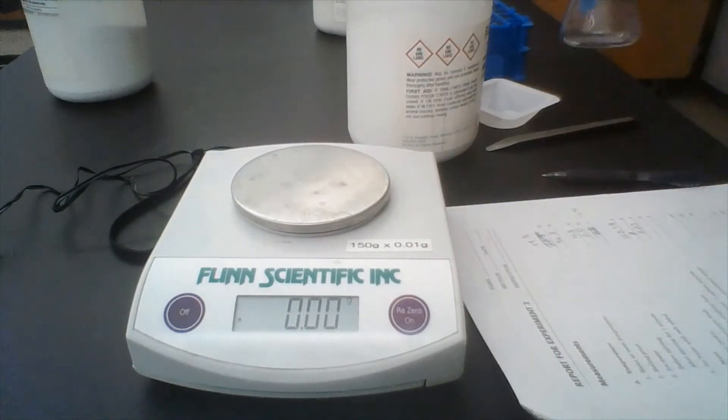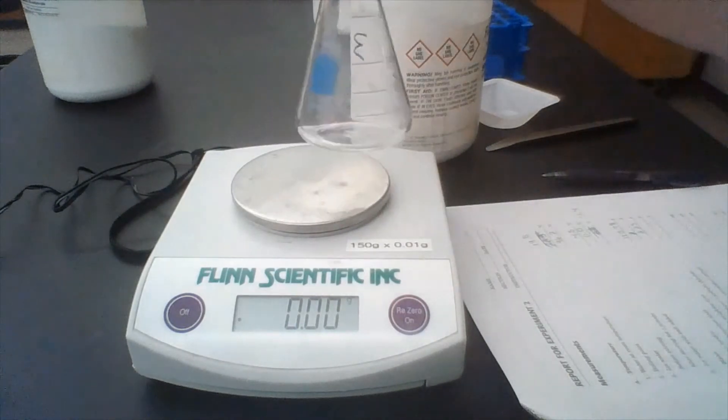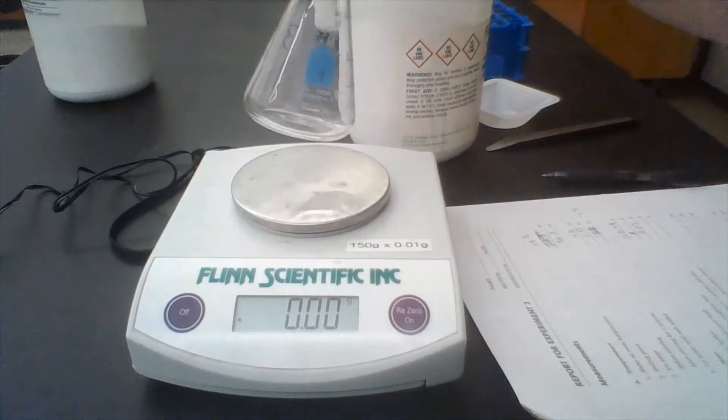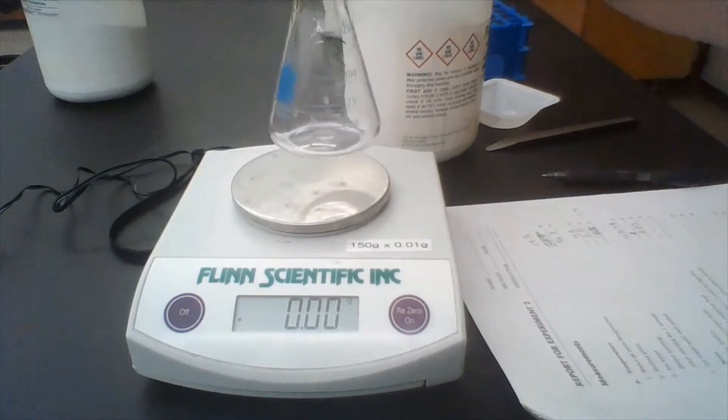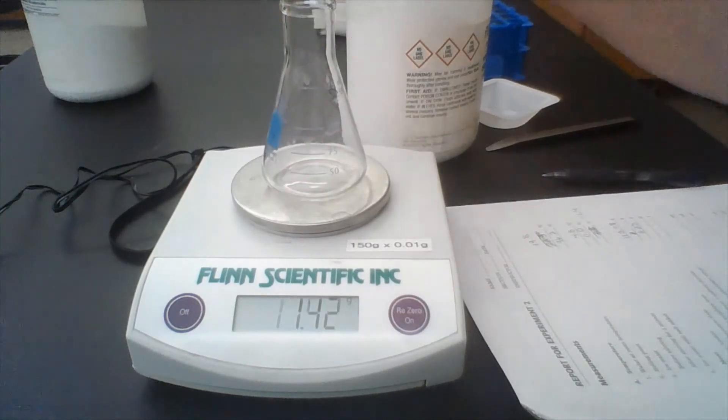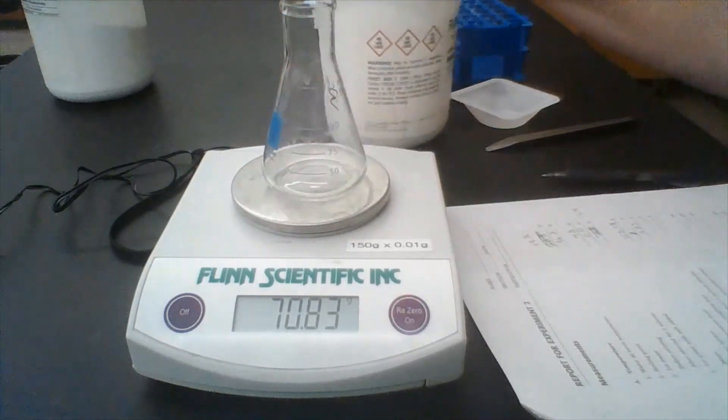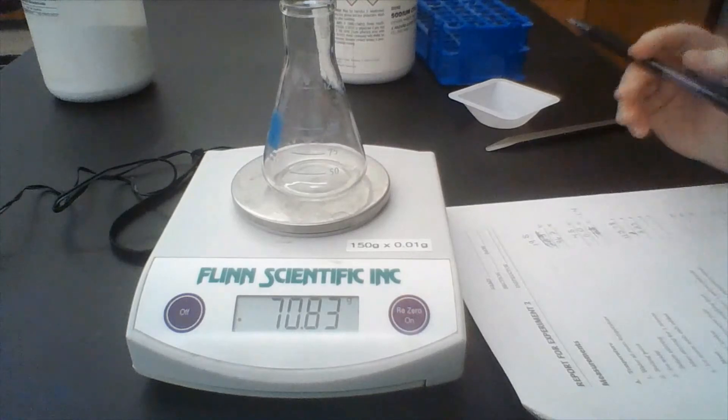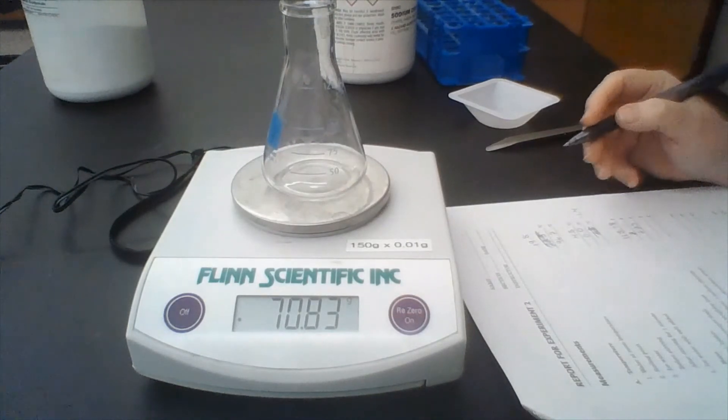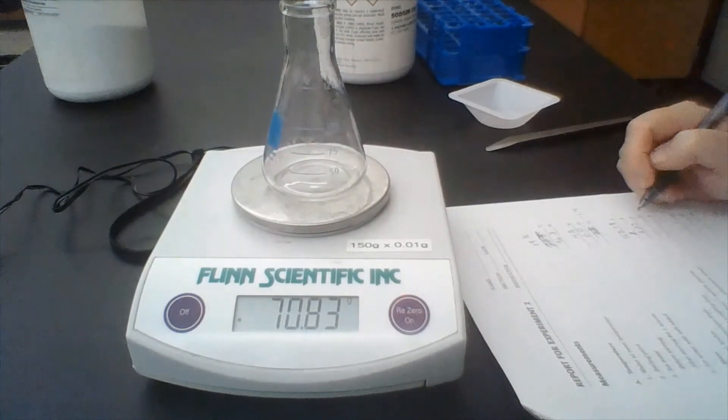And we're also going to measure a 250 milliliter, or a 125 milliliter Erlenmeyer flask. This flask that has the triangle shape is an Erlenmeyer flask, and that weighs 70.83 grams.